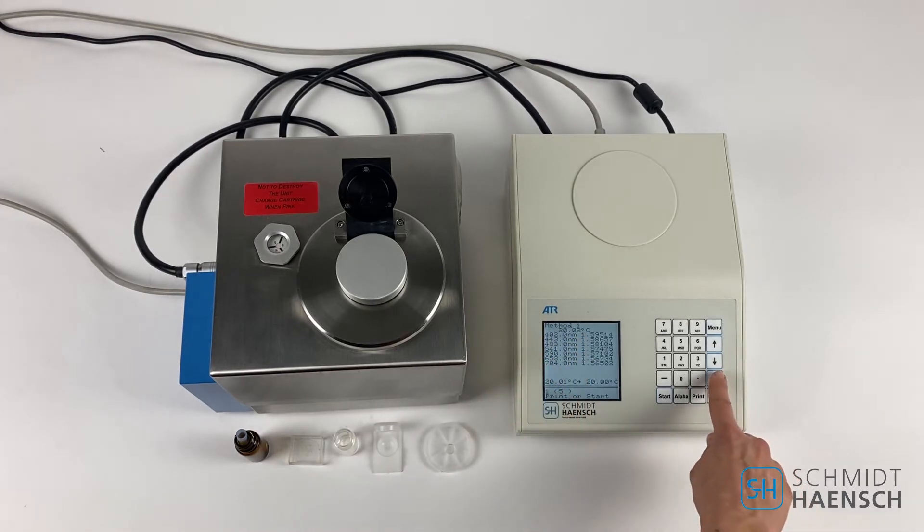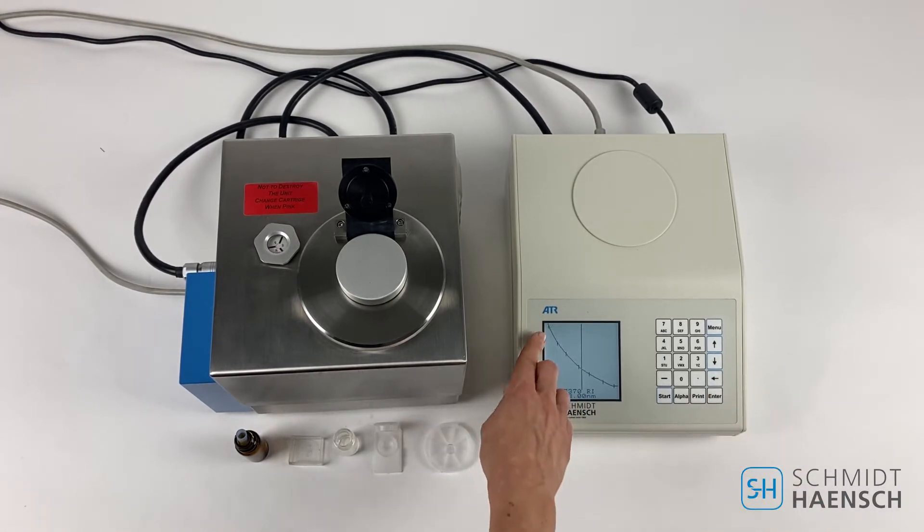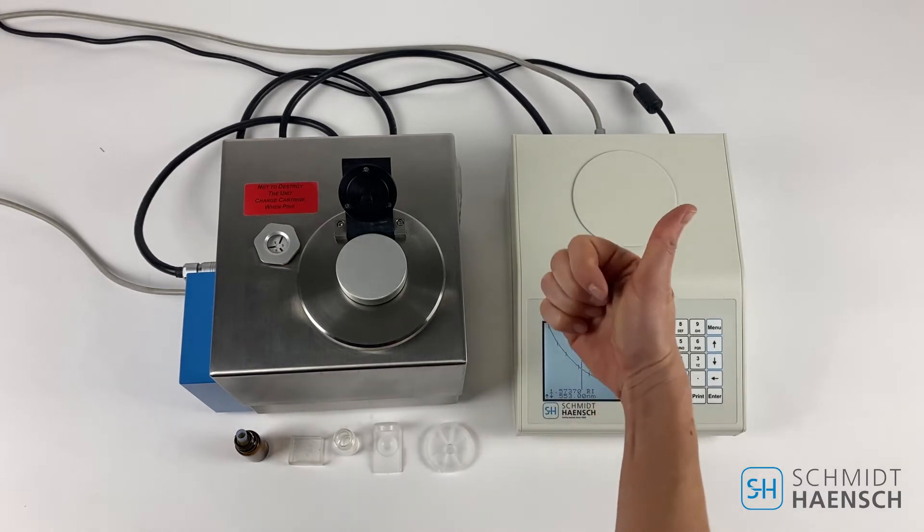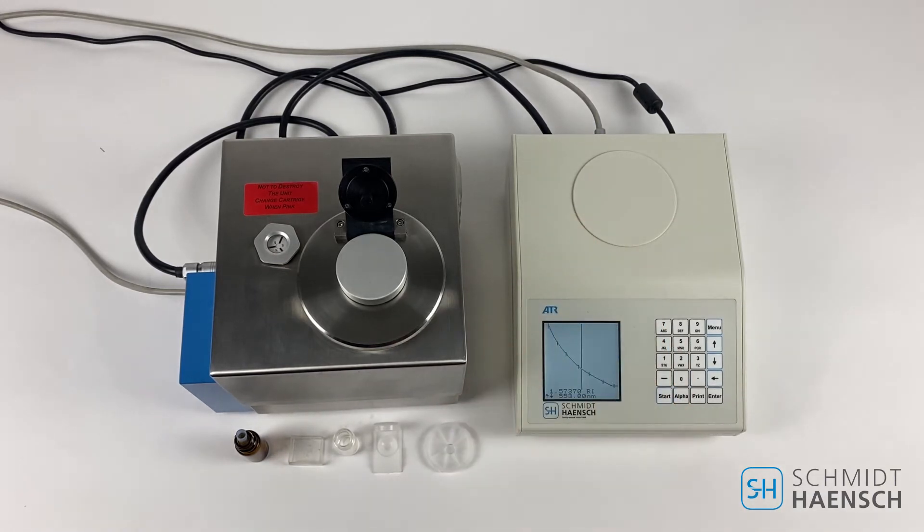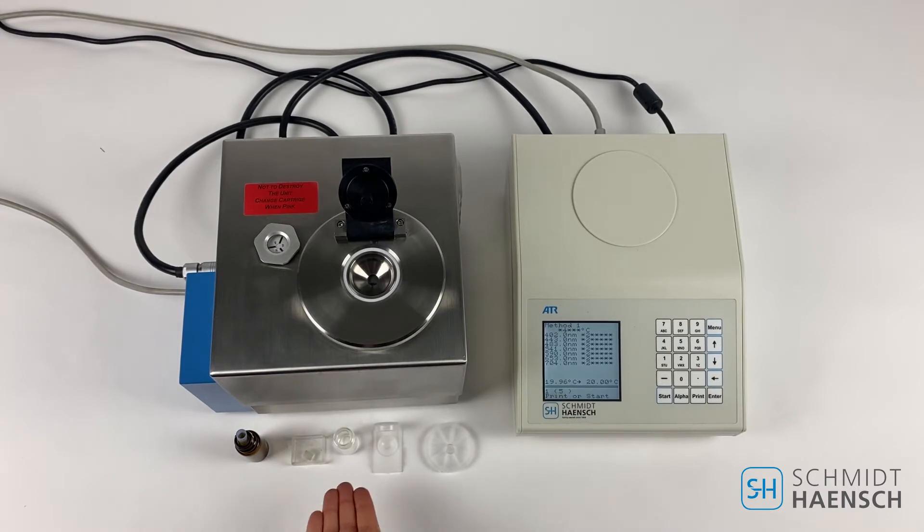After about 20 seconds you can expect your measuring results in table form. On the left side wavelength is displayed, on the right side the refractive index. Press the arrow button on the right side to look at the dispersion curve to ensure the measurement has been performed correctly.